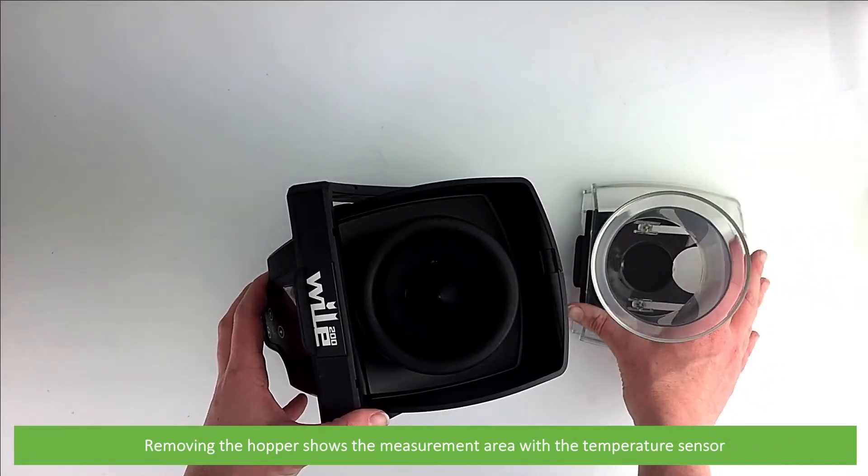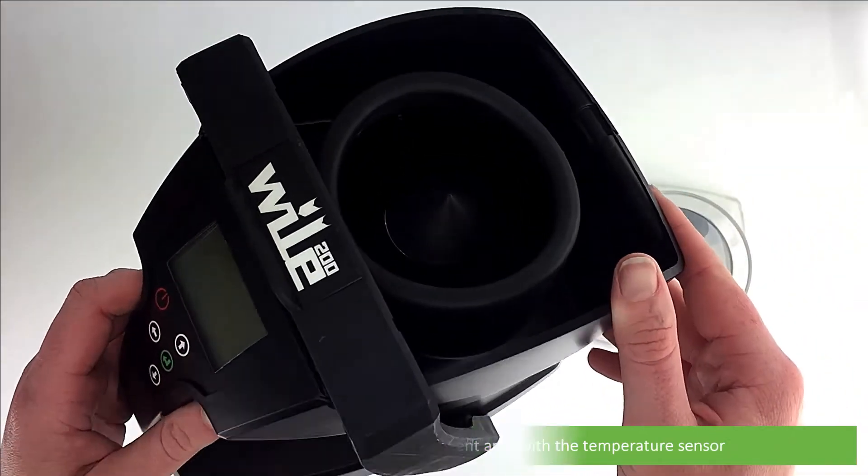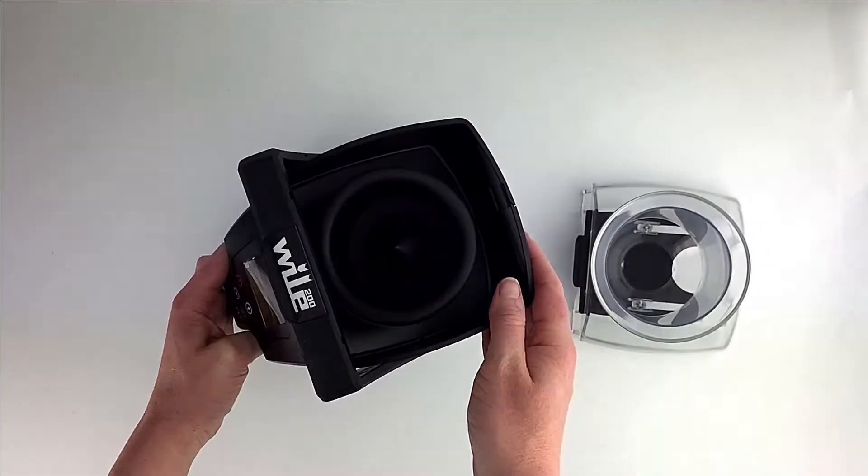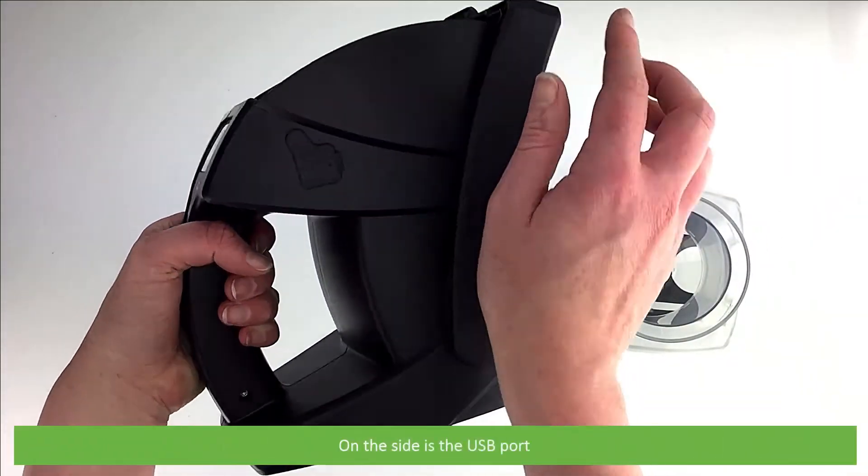Removing the hopper shows the measurement area with a temperature sensor. On the side is a USB port.